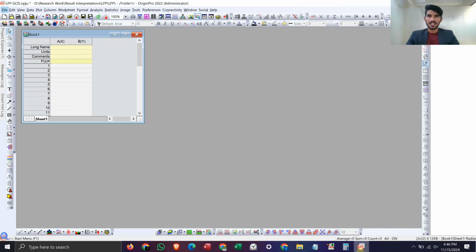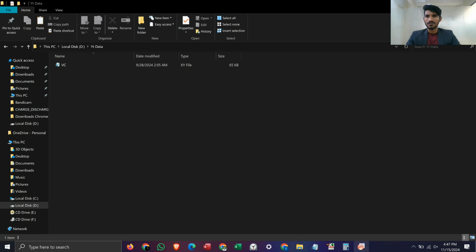Welcome to today's video lecture in which I am going to explain how you can plot XRD data in Origin and how you can remove the baseline. So first of all, what do we have here? We have this file. Okay, so this is actually the XRD file.